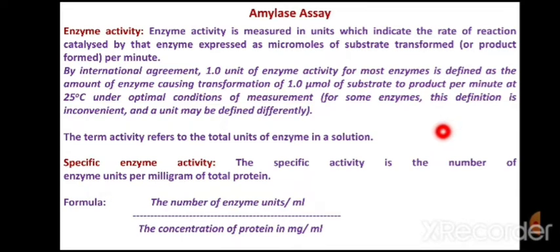Considering that the nature of enzyme is proteinaceous, your preparation is a mixture of several things: your enzyme, and along with it several other proteins.